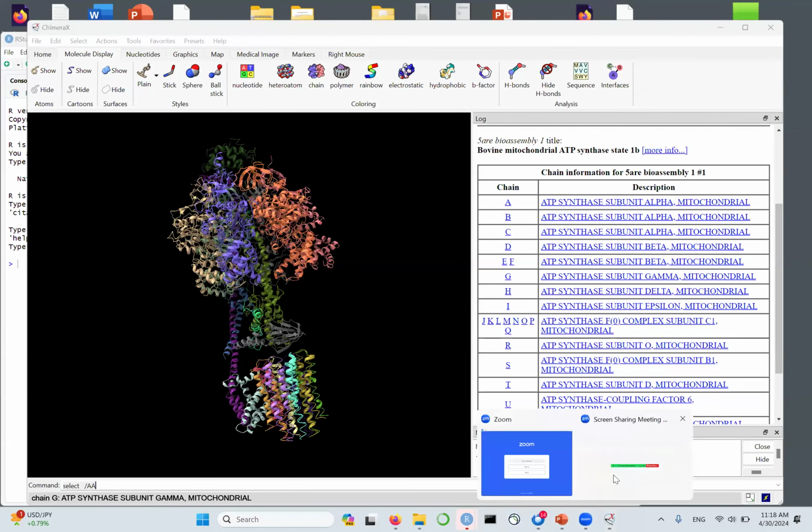And then in reality, you're going to see the mix. This is the case where you've got a lot of protein chains. Some of them are alpha helical, some of them are forming beta sheets. And then if you plot each residue on a Ramachandran plot where they are, you're going to see that the vast majority of the residues will end up in the regions that are allowed. Those are marked in blue, and then some of them are going to be outside in the regions where they shouldn't be. Okay, the things marked in triangles are glycines, which are allowed in extra regions.